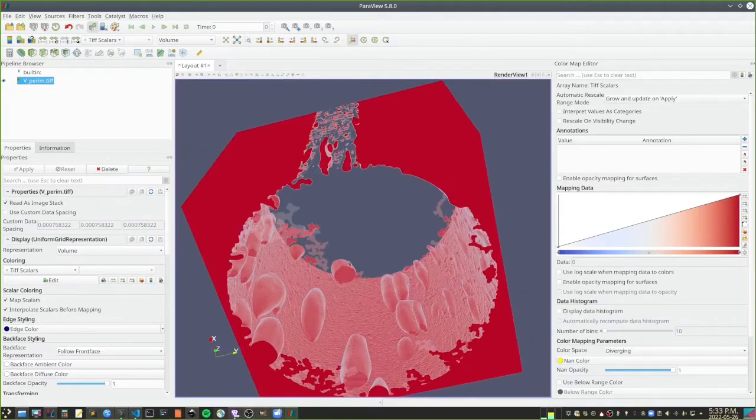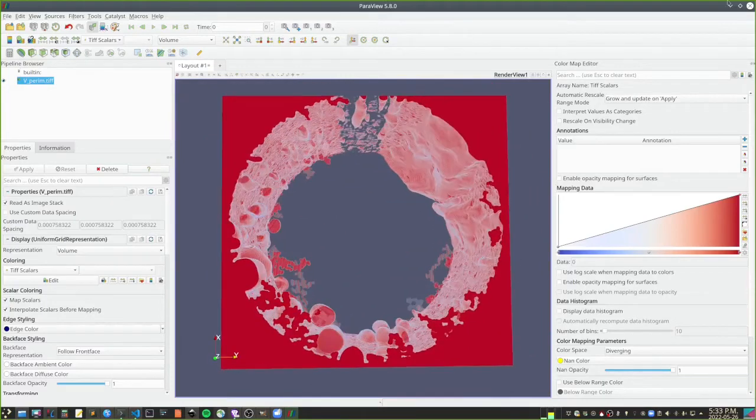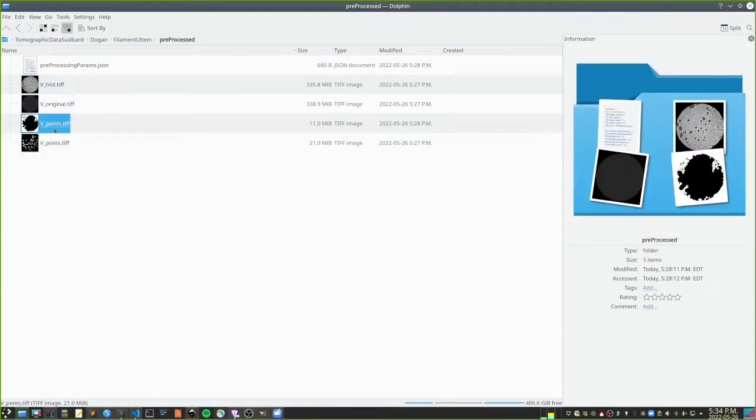The first and the last layers, we don't need to worry about that. I don't know how you'll see it in Windows, but here it gives you a preview, and because a volumetric TIFF file is a stack of images, it shows you the first one. So you can always look manually to see if things make sense.